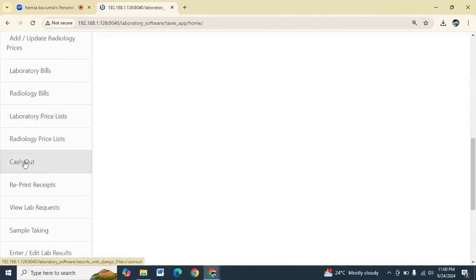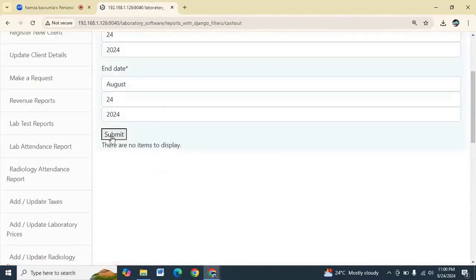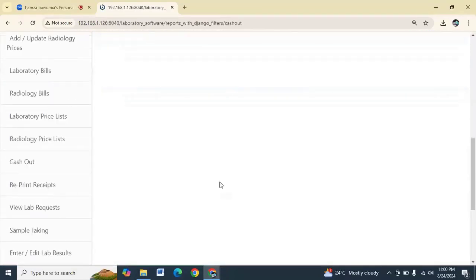And then when you use the cash out, you want to know how much cash has been made on a particular day. Thank you.